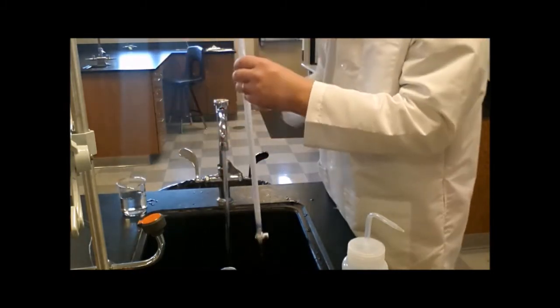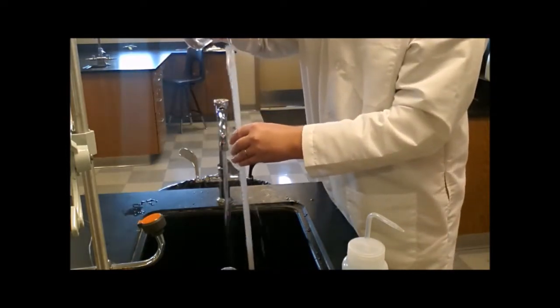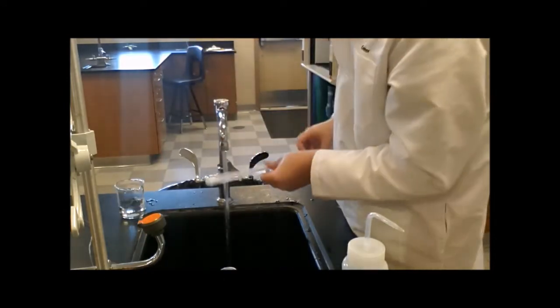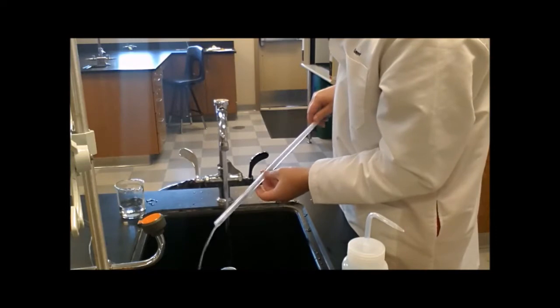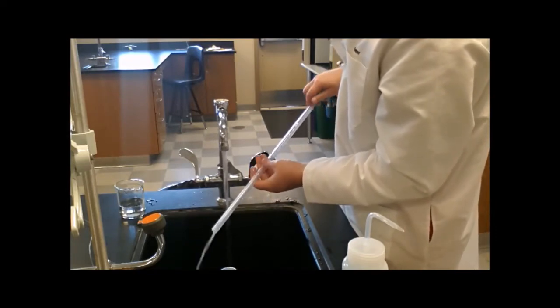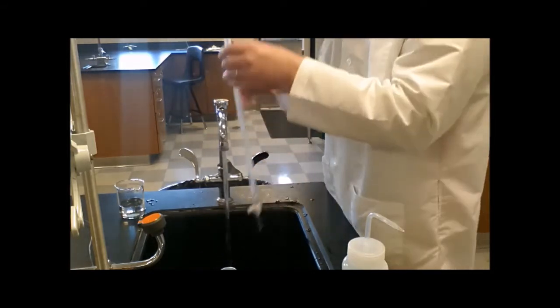Still suds in there. Overflowing on the top. Get all those suds out. Tasty, tasty suds. And then I'm going to turn it upside down and twirl it, and let it drain out. Still suds inside the burette.